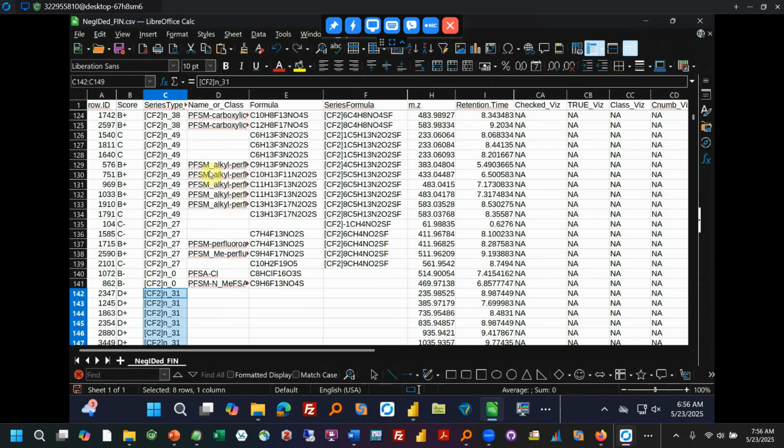If you are in blood or something, you might have very few A's or no A's, very few B pluses, or even no B pluses. Rare, but possible. In which case, you may have no PFAS in your sample. You might have detected something, depending on your sensitivity and what type of matrix you have.